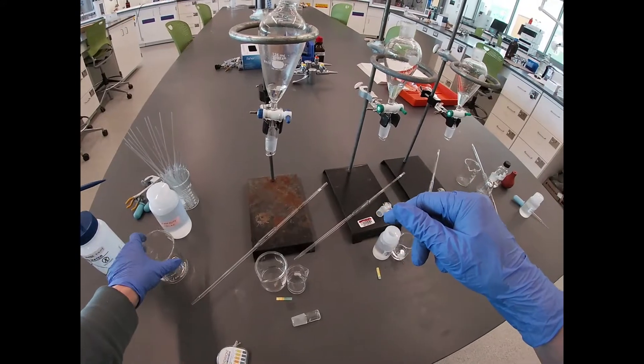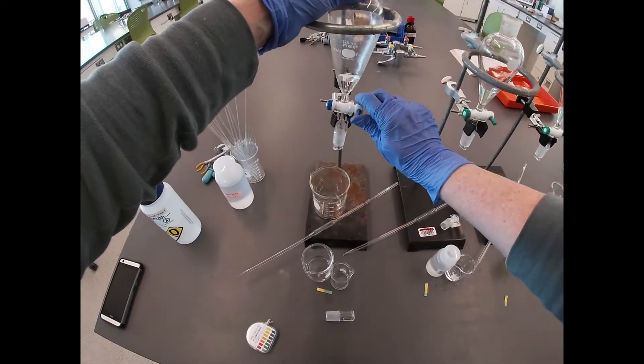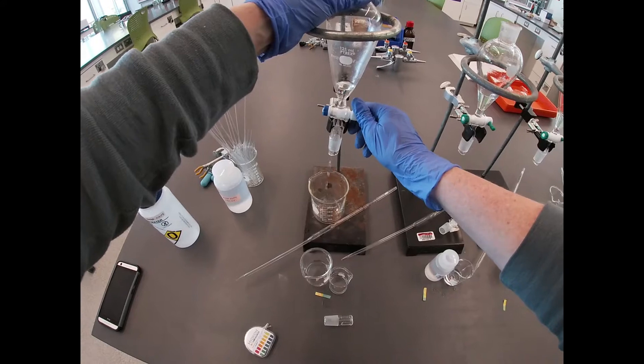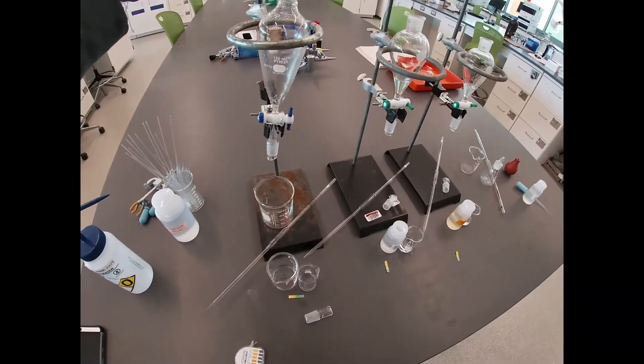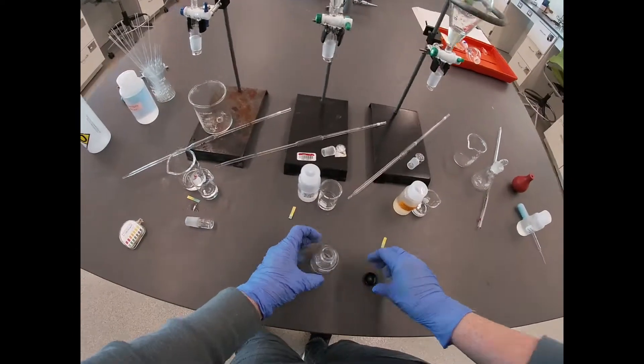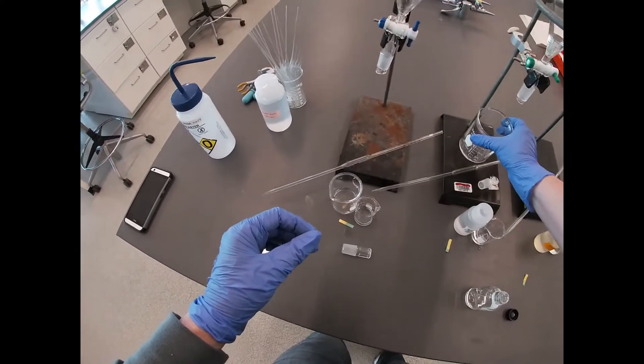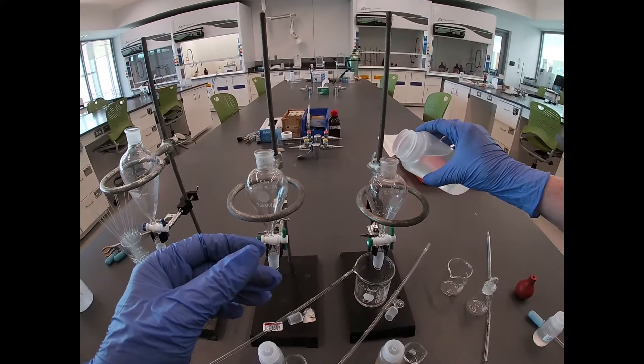What we're going to do since we do not have an additional set of extraction funnels is drain these in a quick chloroform rinse, and then we'll rinse them with some of our acid before we do the extraction.